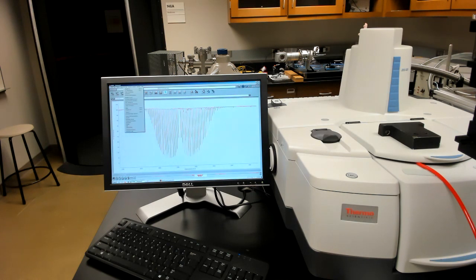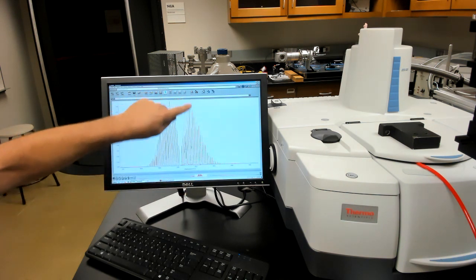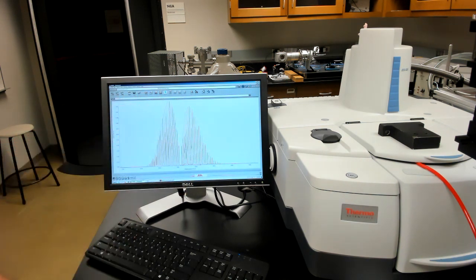So we'll process this into absorbance. Well, it's a simple transformation, which the machine has no problem calculating. Let me just rescale, and there we are. The main thing is that now the lines go up, and the height of the line is proportional somehow to the concentration of the absorber. So it's easier to analyze. Let's zoom in a little bit more. Okay?